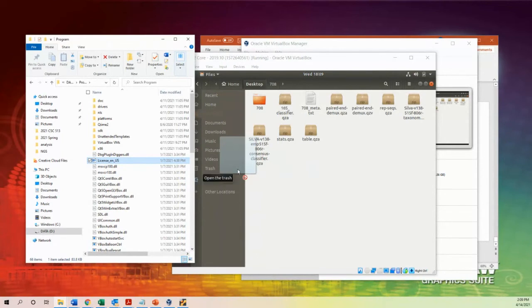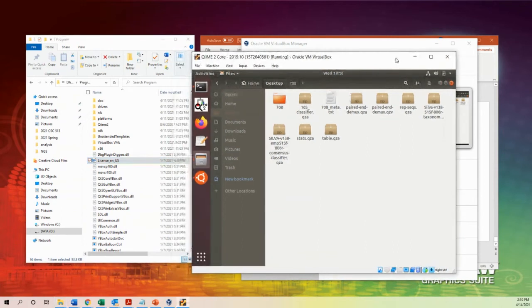Otherwise, if you see this red sign, you can move around the area to see whether it shows the plus copy. If you find nowhere in this area that shows the plus copy, what I do is close the Shiny tool and restart it again. Okay, I'm going to try that. Thank you. Okay, good.